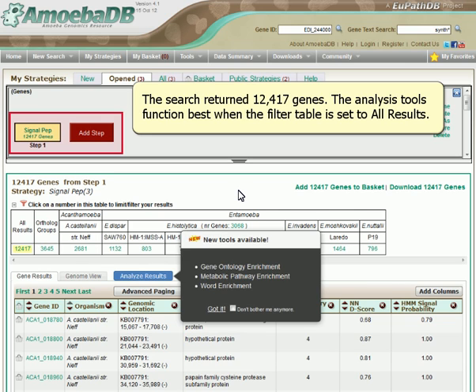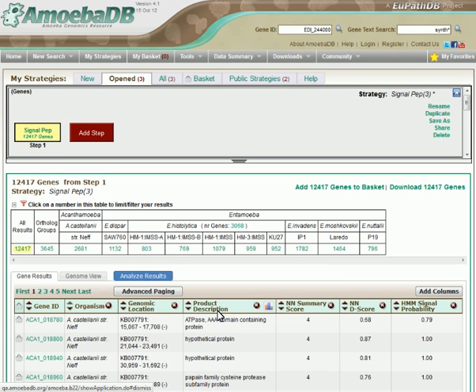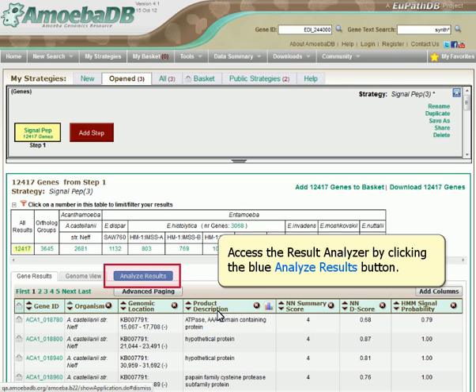The search returned 12,417 genes. The analysis tools function best when the filter table is set to All Results. This banner announces new analysis tools. Access the Result Analyzer by clicking the blue Analyze Results button.